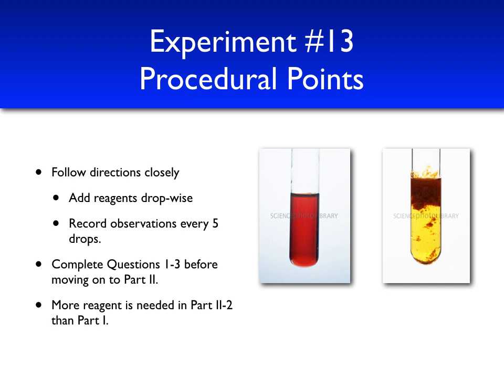Again, sometimes you'll note that after a precipitate forms, it might redissolve to form a clear solution, indicating the formation of a complex ion. So it's very important as you note the observations to record all observations after each addition of reagent.